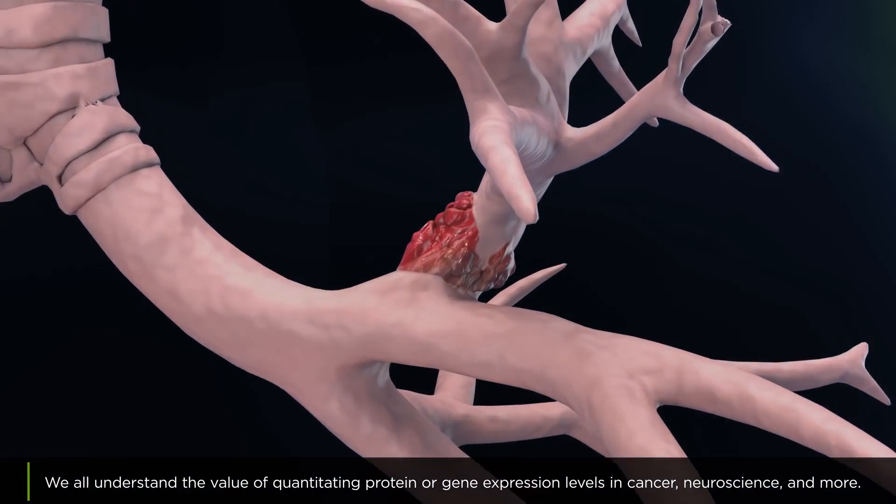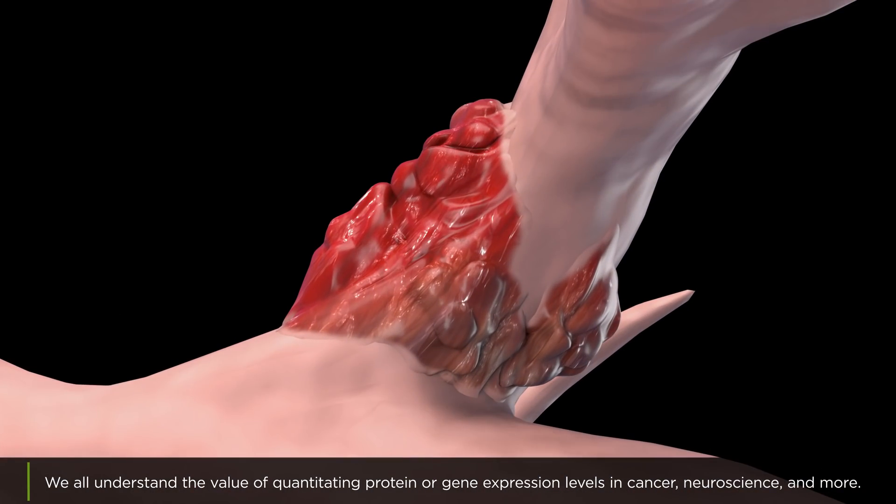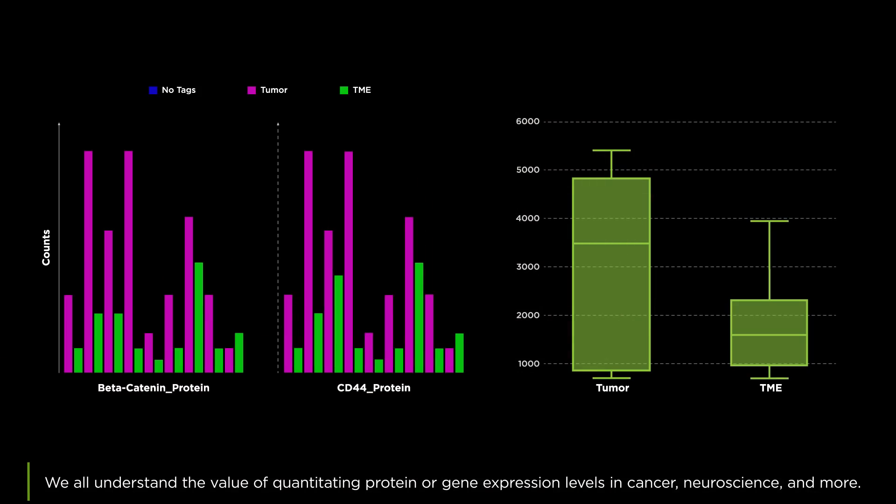We all understand the value of quantitating protein or gene expression levels in cancer, neuroscience, and more.